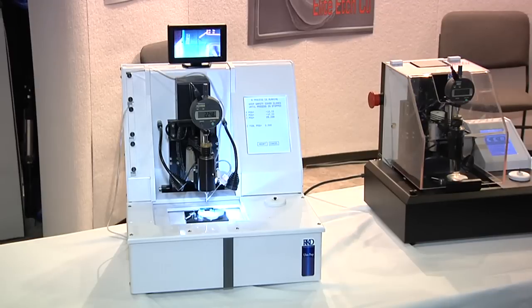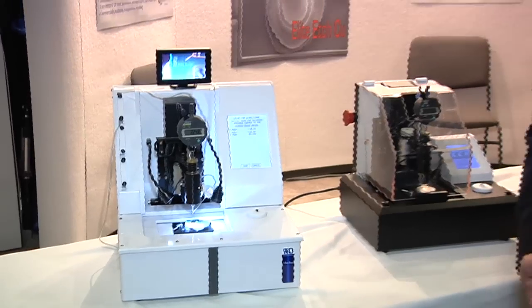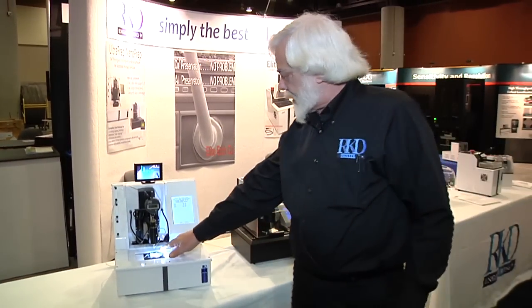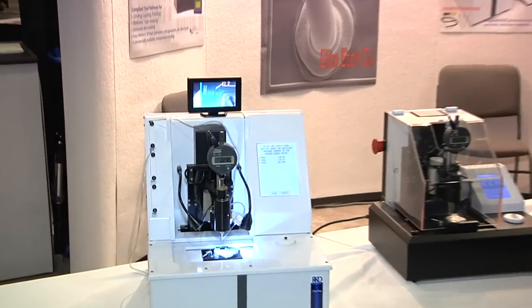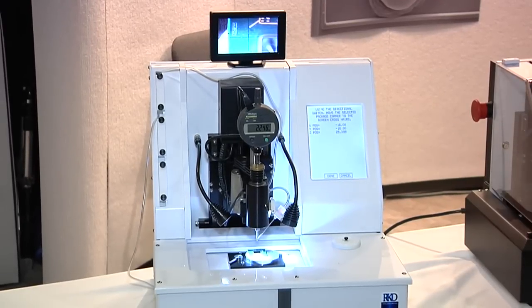This results in a relatively constant ending die thickness. The die is immobilized by the wax mounting and then machined in accordance to the measured profile.